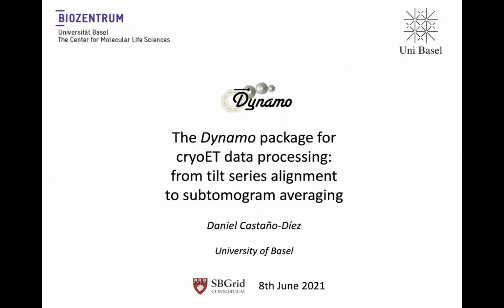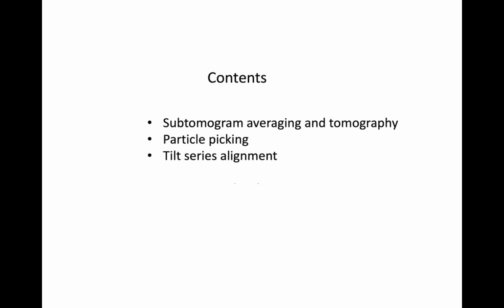Okay, then let's start. So as Shaun explained, Dynamo is, or was at the very beginning, a software package for subtomogram averaging. But what I want to present now is some of the extensions that we have been developing in the last years to make it suitable for the full cycle of cryo-electron tomography.